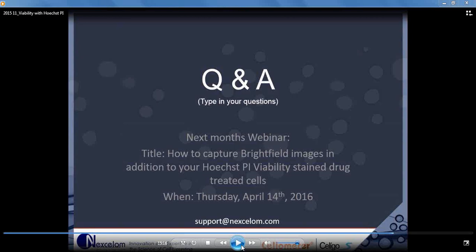So this is kind of like a catch-22, because on one hand, if you want to wait until all your image acquisition is finished and then start analyzing your data, the amount of total time that you'll spend in front of the Celigo is actually going to be longer than if you had started analyzing your images concurrently as they're being captured. The system has only a minor slowdown in the analysis section.